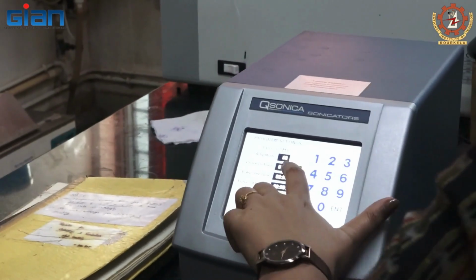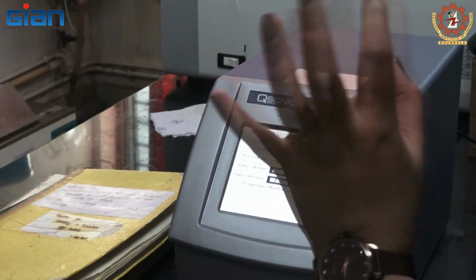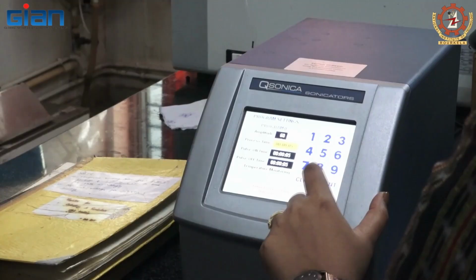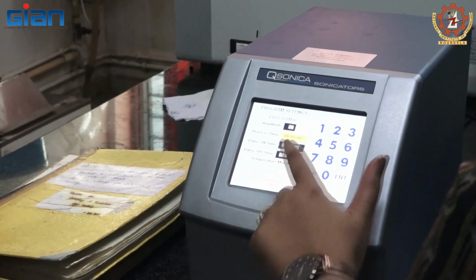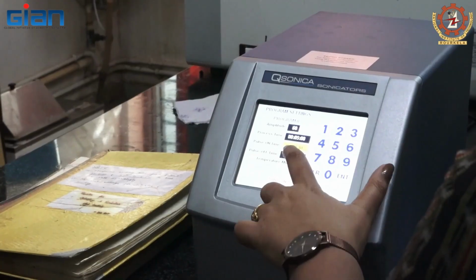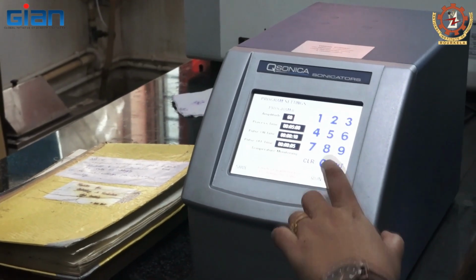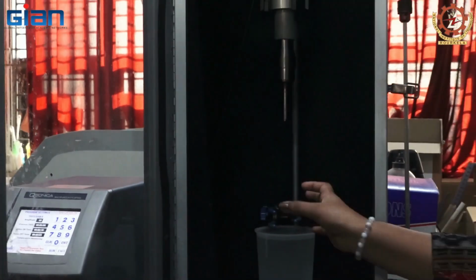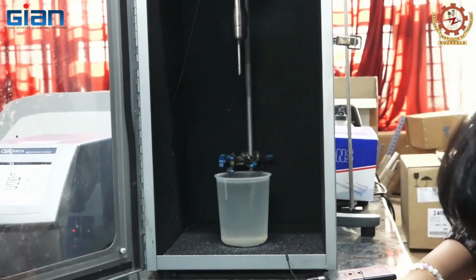Okay, so I will just give you a short test of 5 minutes. Pulse on, I will take as 10 seconds. Pulse off. Then we will put the extractor vessel inside the clamp.